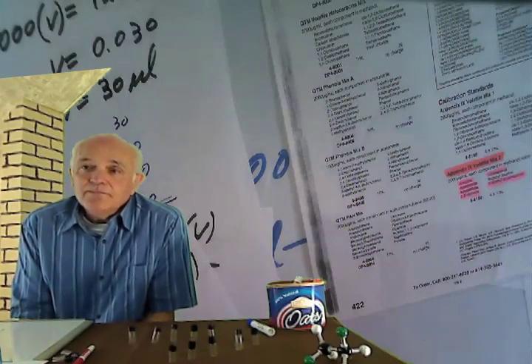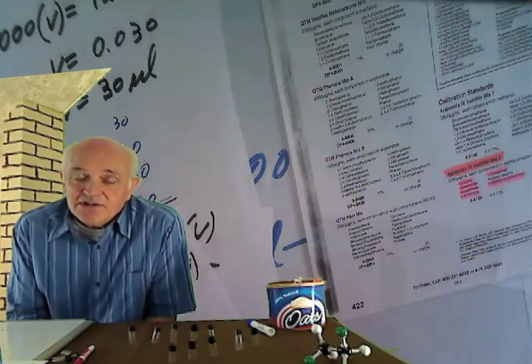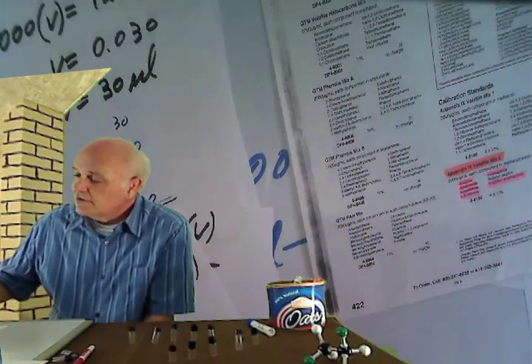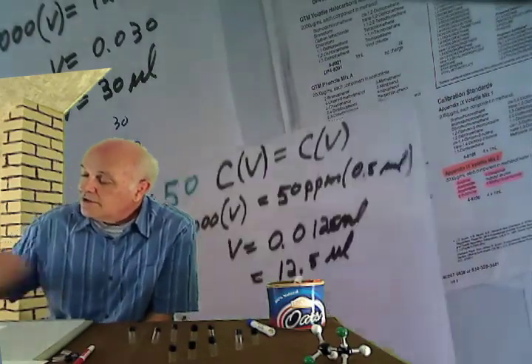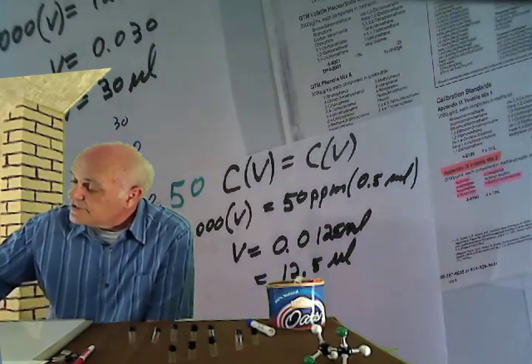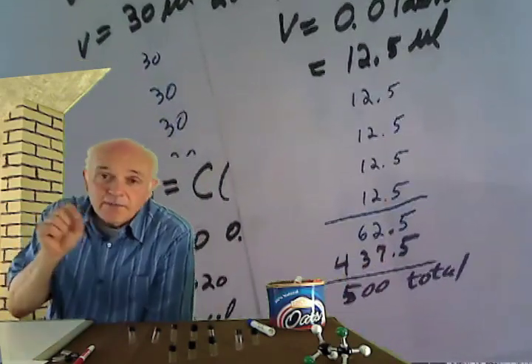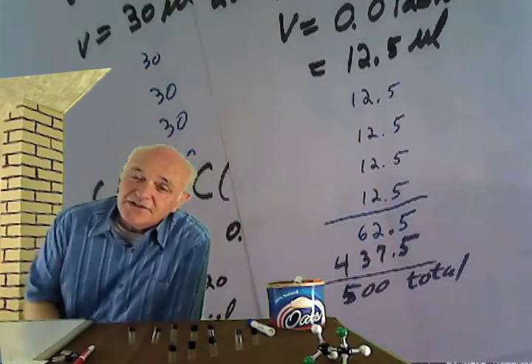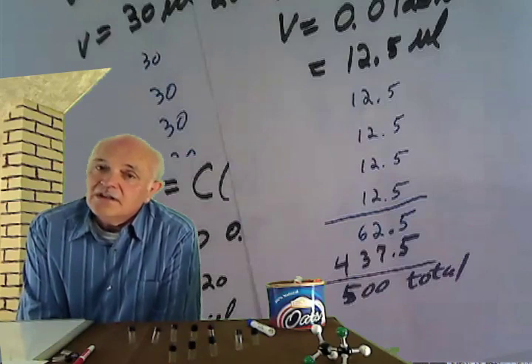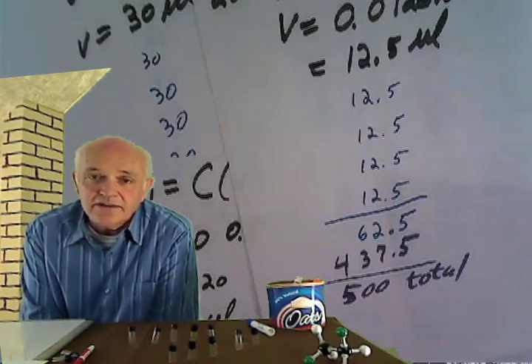And now, next week, you need to make a continuing calibration standard at 50. Just follow the same directions. Take a vial, put in 12.5 microliters in each one. Add 437.5 microliters to bring it up to 500. Add 5 microliters exactly of the same internal standard, and you can hit the ICAL every time, if the other variables are correct, if your GC is working properly.